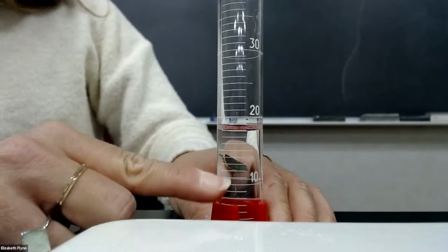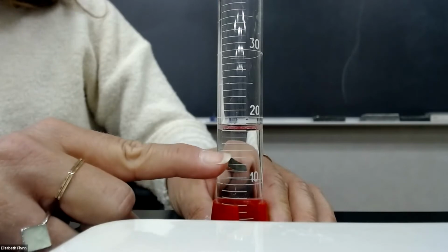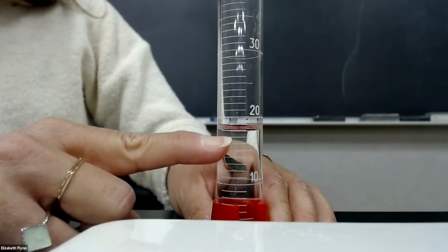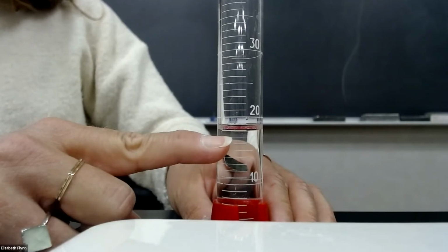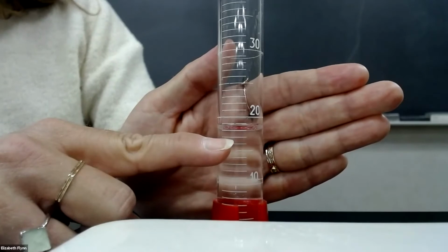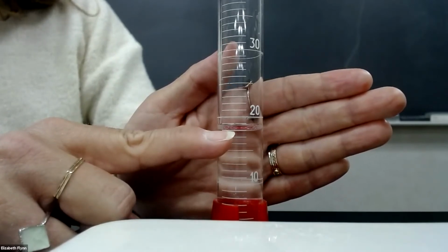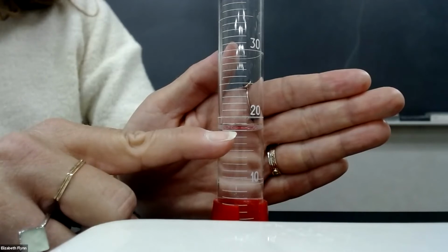All right, so we know for sure there's 10, 11, 12, 13, 14, 15, 16, 17 milliliters, because that's what the lines tell us. 17, now we're going to read between the lines. And when we put our hand behind there, can we see that the very bottom of the meniscus is just below that line right there?